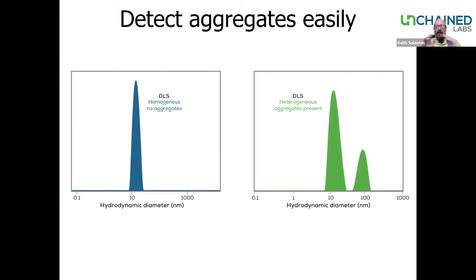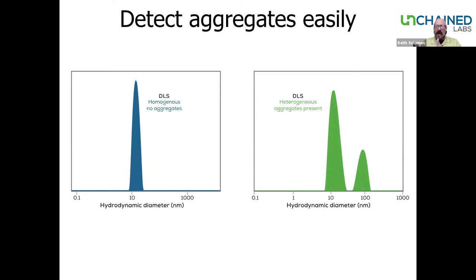DLS is a great technique for looking at colloidal stability. On the left you can see a protein at antibody size with no apparent aggregates, around 12–13 nanometers. After a stress test or some other manipulation, colloids are present — the main peak is broadened indicating multiple species, and there's a well-resolved second peak around 100 nanometers indicating the presence of very large colloids, giving you an understanding of the colloidal stability of this analyte.